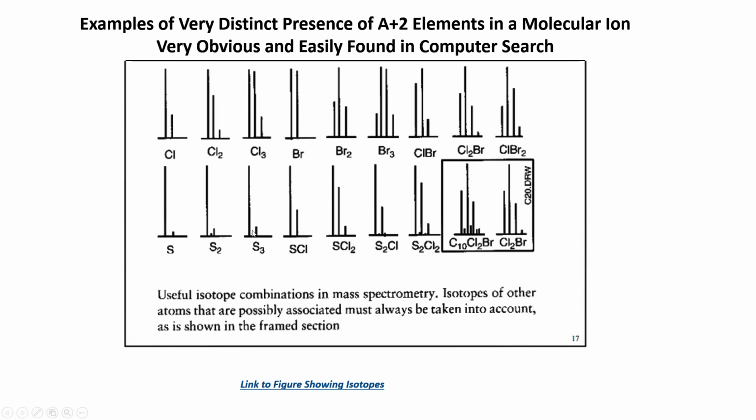Again, we have some here for sulfur. I wanted to show you over here, this is an isotope pattern that they've generated for one that has 10 carbons, 2 chlorines, and a bromine. And you can see, again, we do have some carbon in the compound, about 10% of this ion with respect to this ion for this pattern. But again, very reproducible mass spectra that can be useful in library searches and just if you want to manually interpret a mass spectrum.